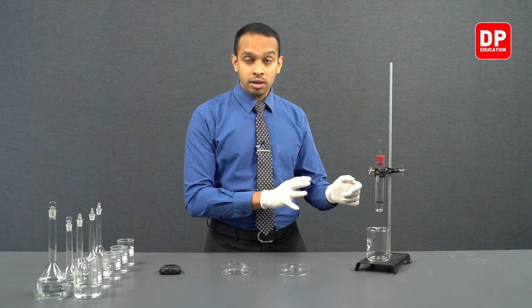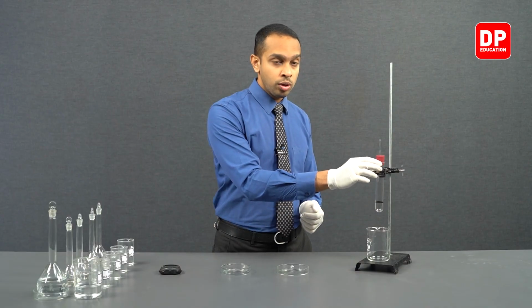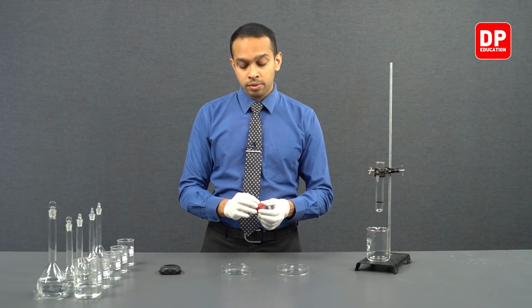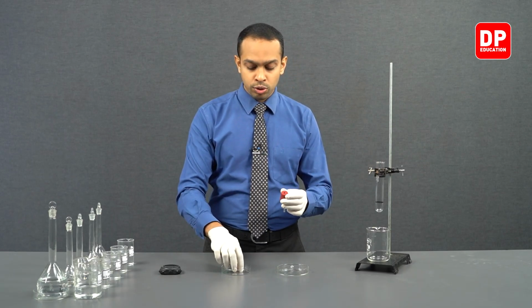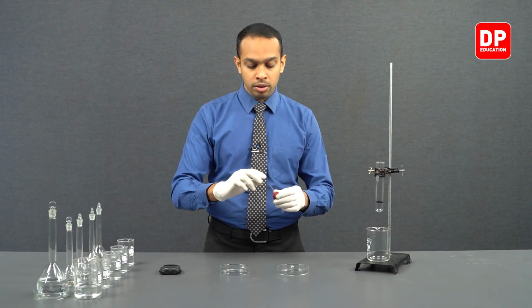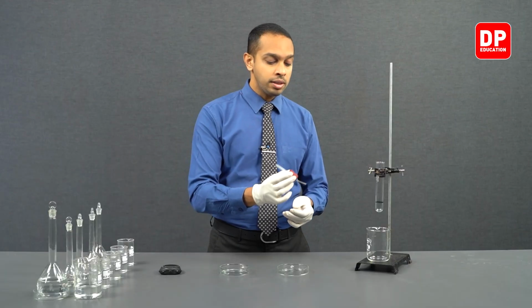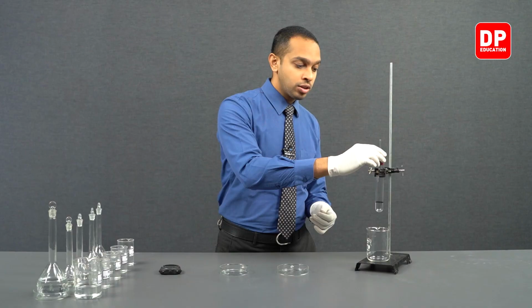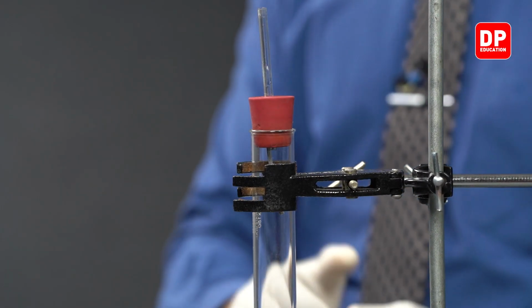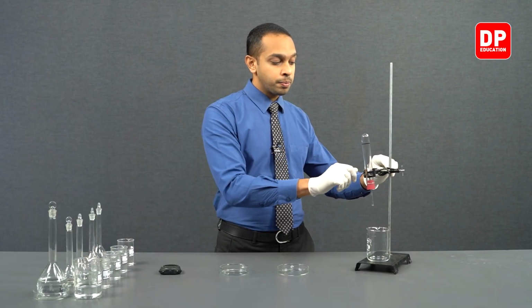So when we are carrying out this experiment, we are first going to fill this boiling tube with HCl all the way to the top, and then we are going to place a magnesium strip on the rubber stopper like so. After doing that, we will be inserting this rubber stopper along with the magnesium into this boiling tube with HCl, and we are going to quickly turn it upside down.